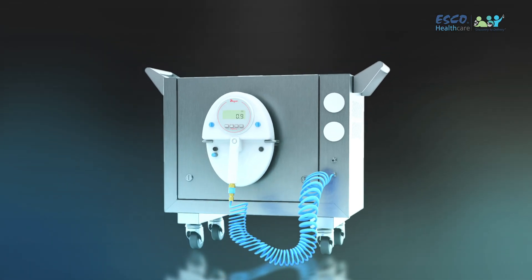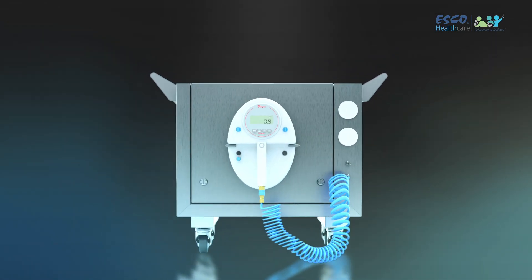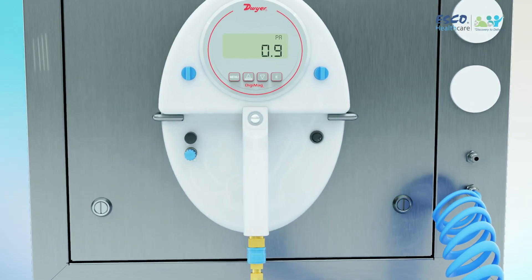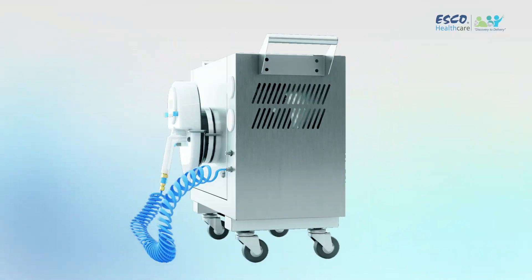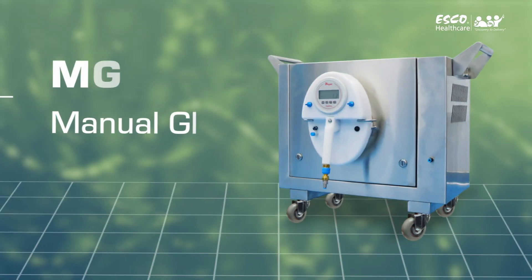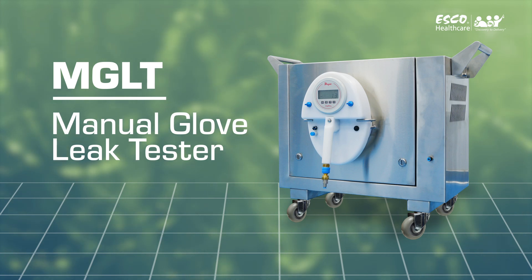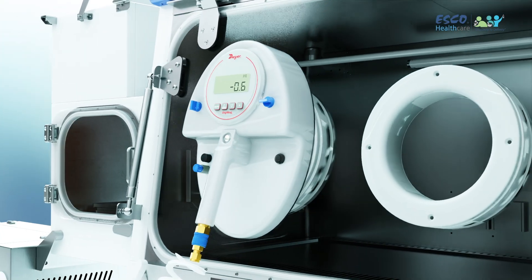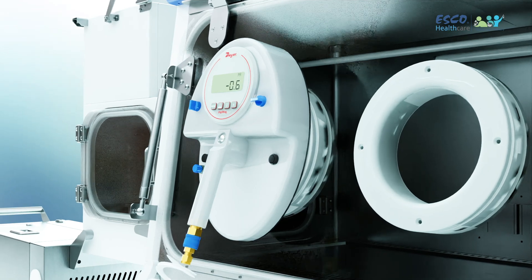Introducing the Future of Glove Integrity Testing: the S-Comb Manual Glove Leak Tester. In clinics where aseptic techniques and safety matter most, ensuring the integrity of your gloves is paramount. Let's dive into the incredible features that make our S-Comb Manual Glove Leak Tester stand out.